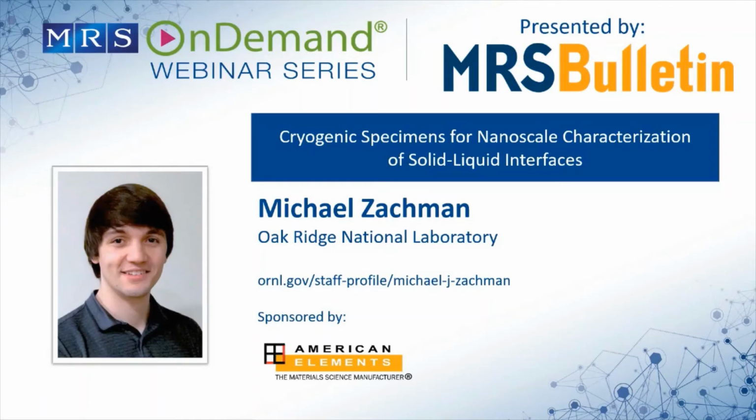The thing that I will say is that if you use a low ion energy, you can run simulations in something similar to the material you're looking at and see how deep the ions penetrate. And cryogenic lift-out samples, because they're so soft, tend to be thicker in the end than a nice room temperature hard material would be. So if your ions may go in 20 nanometers or something, and then your lamella is 100 or 150 nanometers thick, you still have a pretty large section that could be undamaged. But again, this is all material dependent, and I can't tell you ahead of time. I couldn't predict what type of damage would happen for any particular material, just what we've seen. Right.